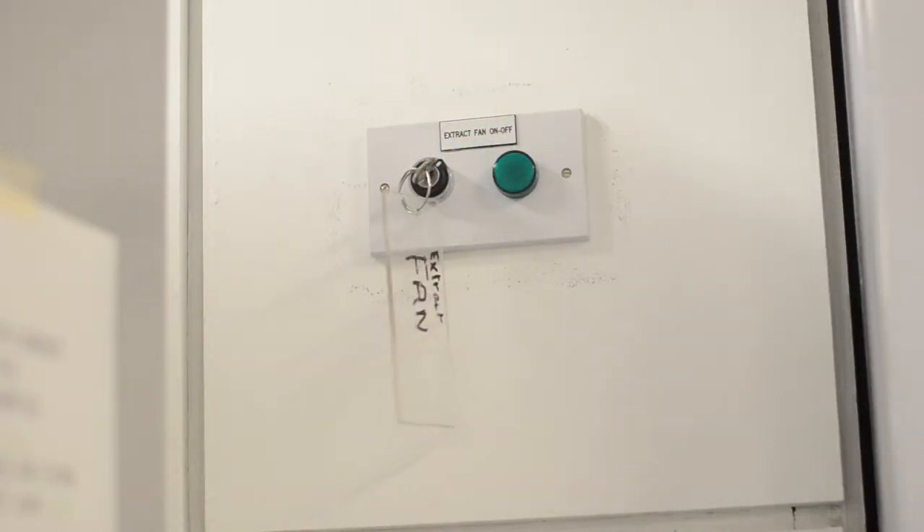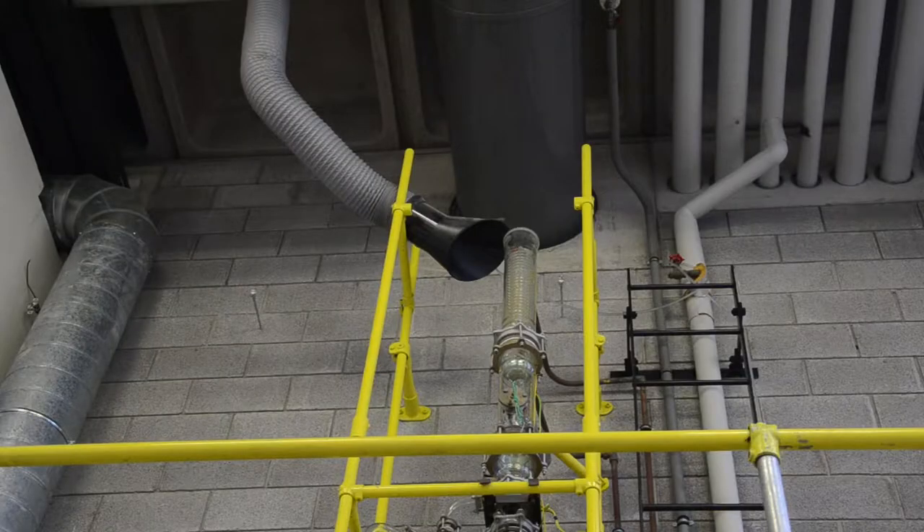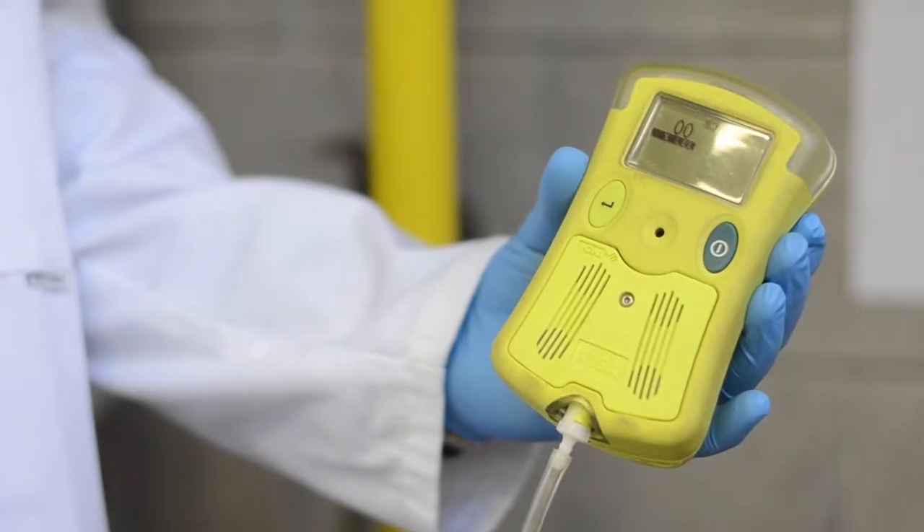An explosive vapour monitor is connected to the top of the column. Vapour which does not condense in the condenser flows to the device and is analysed. If the vapour exceeds the relevant explosion limit, an alarm will sound.